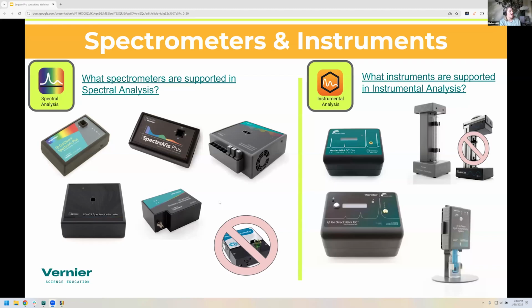All right. Hi, everyone. So Earl touched on it briefly, but the previous app, Graphical Analysis, is kind of your go-to for everything. But I saw a lot of you are chemists in the audience, and even physics people love spectrometers. So a lot of you may be wondering, what about my spectrometer? I tried to plug it into Graphical Analysis and it didn't identify. It will not. You need to use all your spectrometers in a different app called Spectral Analysis.